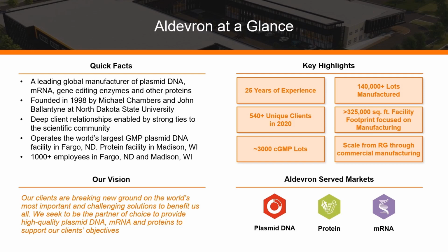I will start with a high-level overview of what Aldevron is, where we are, where we came from, and what we tend to do. Then I'll transition into a bit about method validation in general. I think it's a topic worth discussing and it will set the foundation for the last part of the talk, a case study in practice of how Aldevron approaches method validation and how we continually try to innovate and bring on new technologies that allow us to make these platform methods at the end of the day to support our clients and their process. With that, I'll jump straight in.